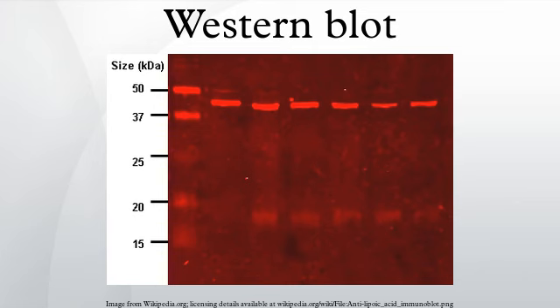In practical terms, not all Westerns reveal protein only at one band in a membrane. Size approximations are taken by comparing the stain bands to that of the marker or ladder loaded during electrophoresis. The process is commonly repeated for a structural protein, such as actin or tubulin, that should not change between samples. The amount of target protein is normalized to the structural protein to control between groups. A superior strategy is the normalization to the total protein visualized with trichloroethanol or epicocconone. This practice ensures correction for the amount of total protein on the membrane in case of errors or incomplete transfers.